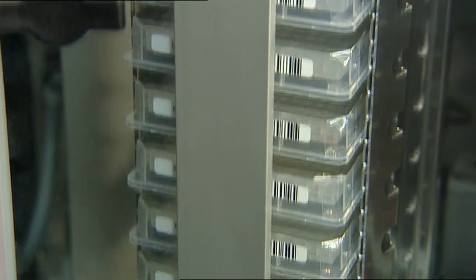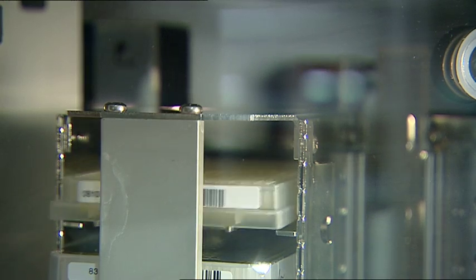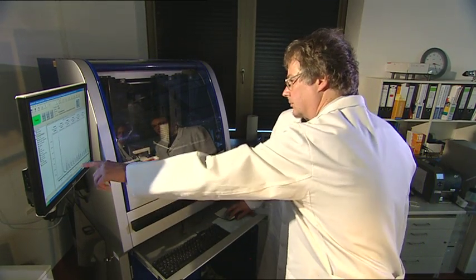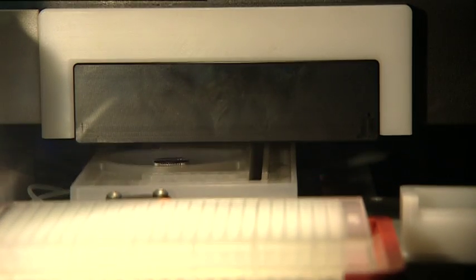The screening unit has a library of more than 50,000 substances. They are tested for active ingredients with the most modern technologies. For example, the screening laboratory is the only academic institution in Germany to work with a lab-on-a-chip device. Among others, it's used to look for active ingredients for treating tuberculosis and other infectious diseases.